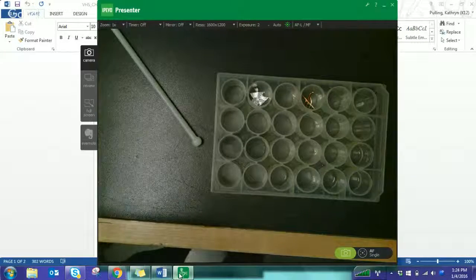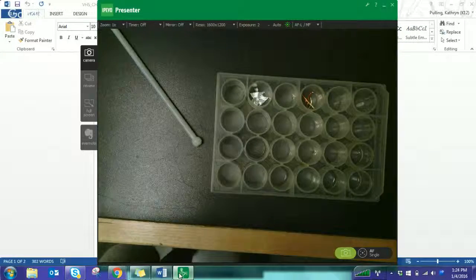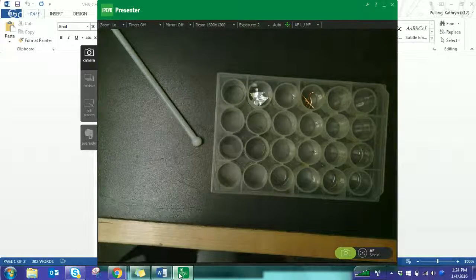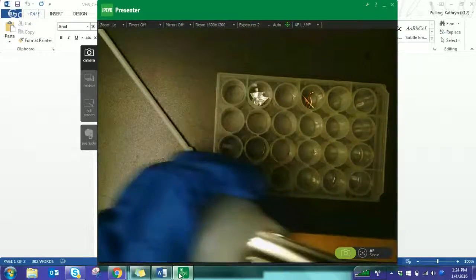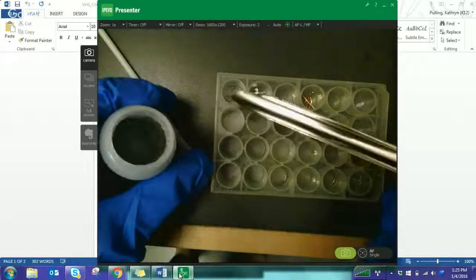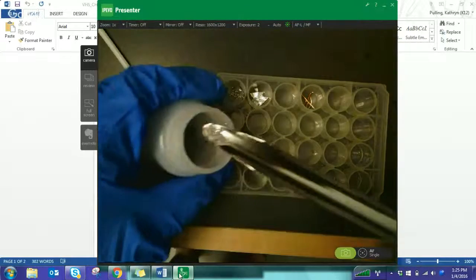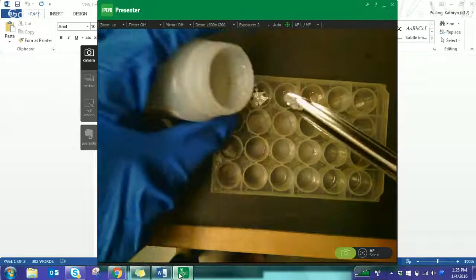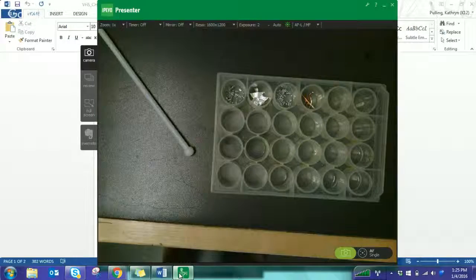All right. Now you should get some good reactions out of this. I think if I recall correctly, only one doesn't react. Zinc's a little messy, just because it sticks to the plastic. Try really carefully not to get it into the other wells. Okay, if you want to, take a picture of what these look like before you add the chemicals.